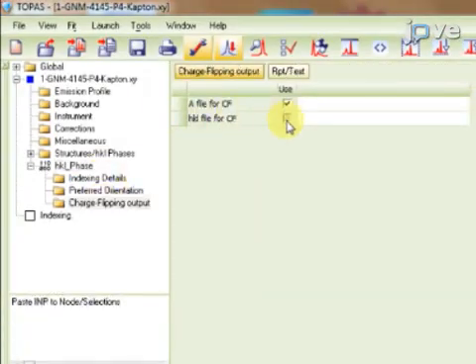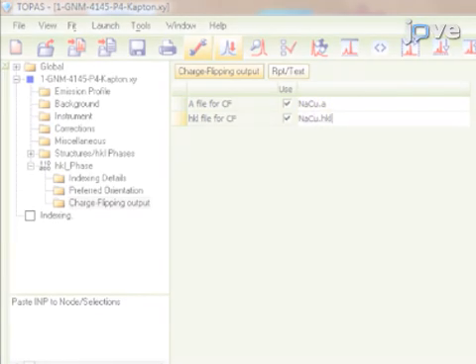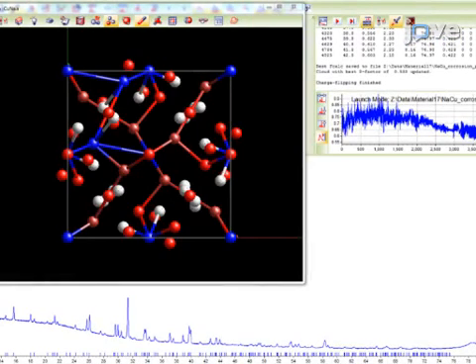Finally, create a list of Bragg Peaks suitable for charge flipping. For crystal structure determination, use the method of charge flipping supported by the inclusion of the tangent formula to find the positions of most of the heavier atoms.